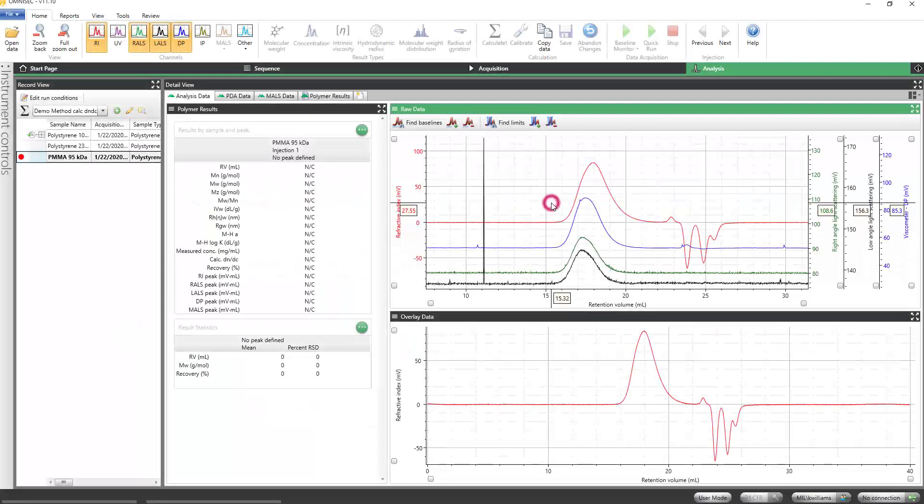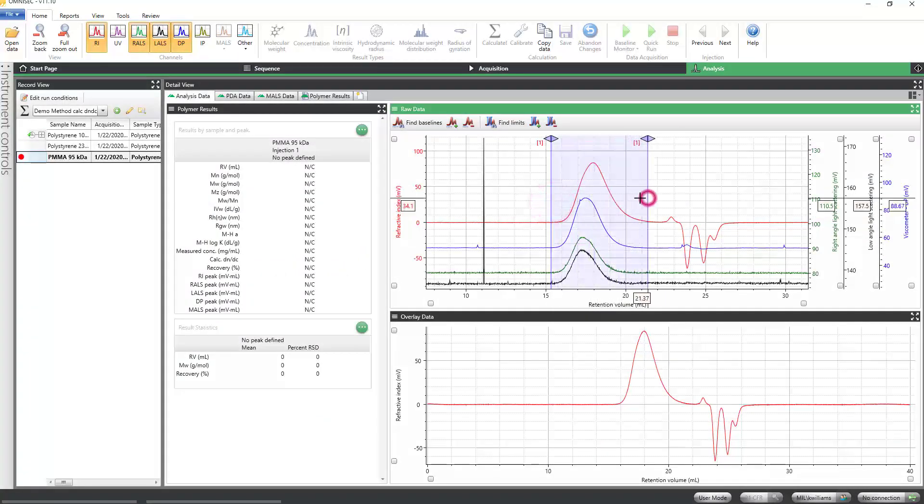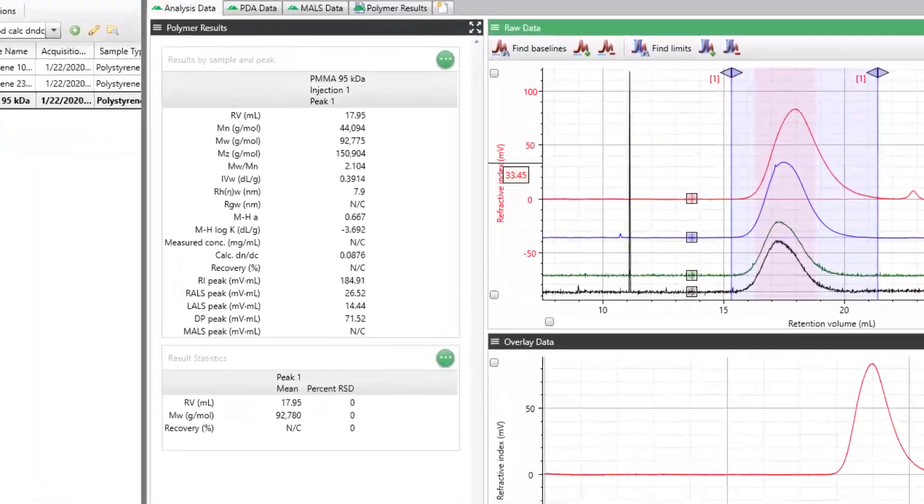Knowing the DNDC value for your sample increases the accuracy and amount of data available. So let the Omnisec software do what it does best and help you out.